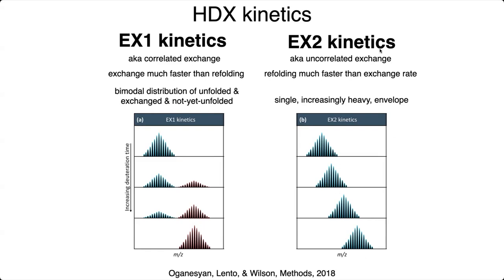This is your EX2 kinetics. This is the more common one. The other main option is that your exchange is actually happening much faster than refolding. So when we think about EX2, we're thinking, okay, every time it opens up, you're going to get one exchange or just a couple of exchanges.